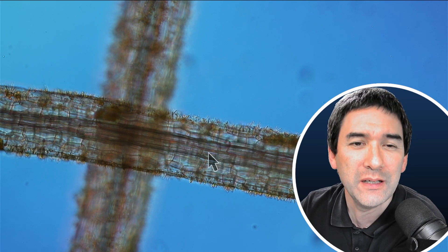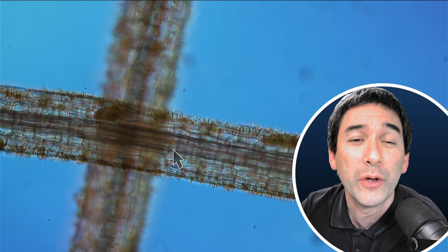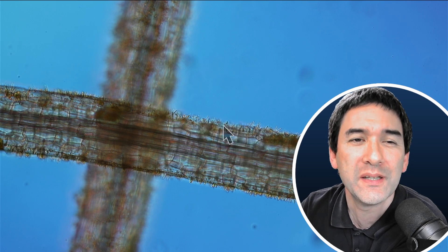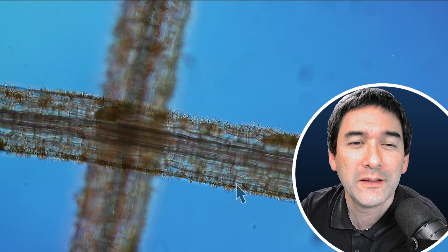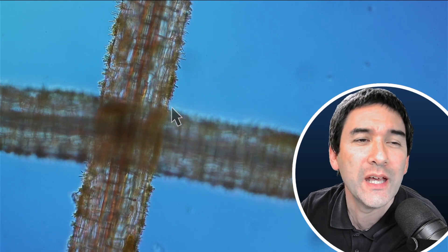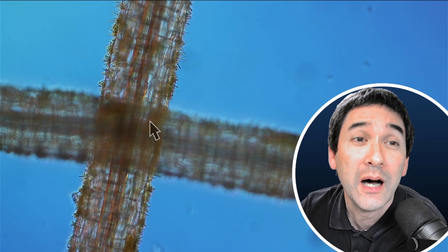But the really interesting thing is not the algae itself but rather what is growing on it. I'd like to direct your attention to the surface here and you might see that it looks a little fuzzy. There are other organisms growing on top of the algae and these are actually cyanobacteria among others.